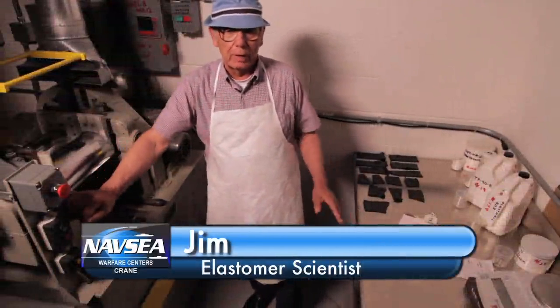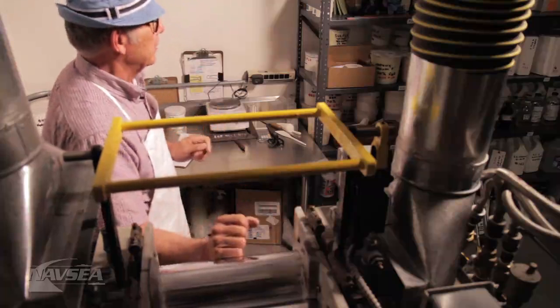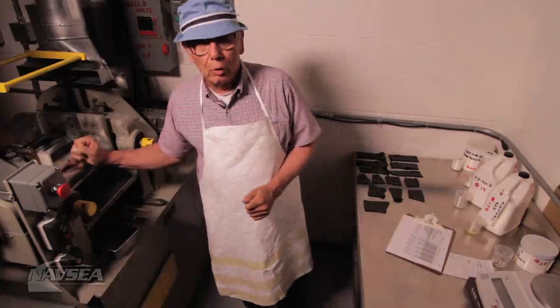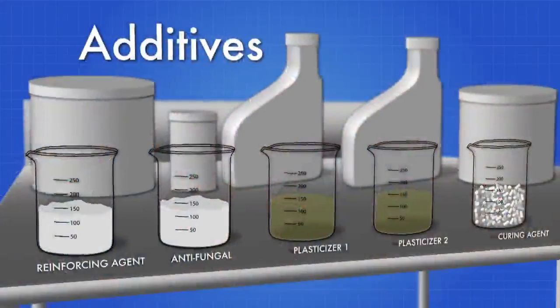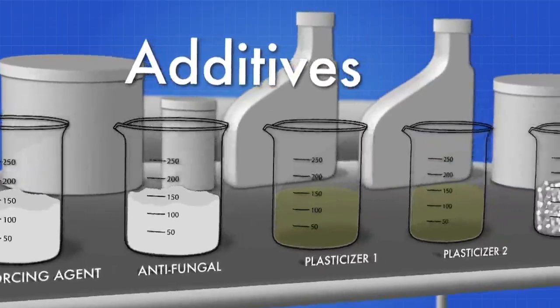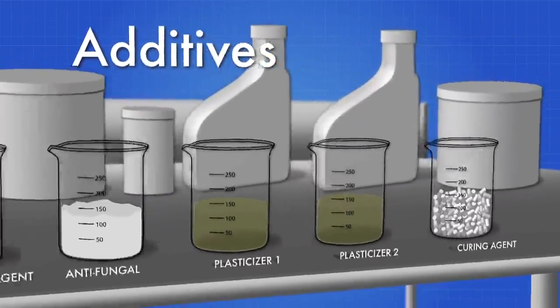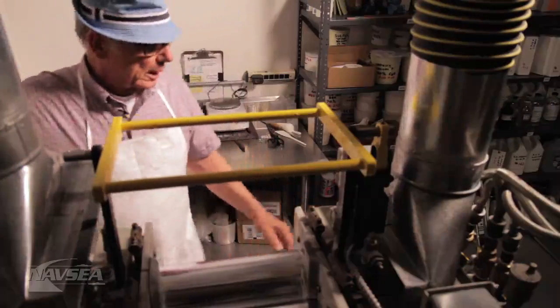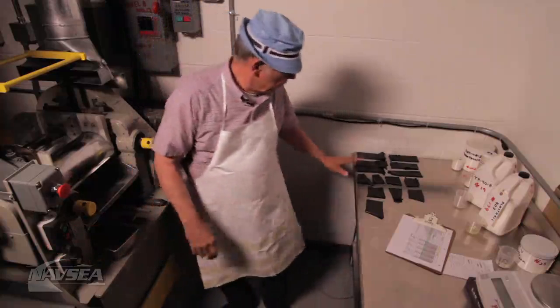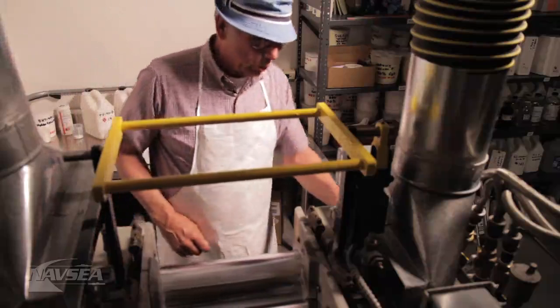Thanks Andy. We're back here at the laboratory mixing mill — the very first area of our processing. We are going to show the class a rubber mixing mill. This is a two-roll mixing mill. We are going to take this rubber and add all of these additives to these two different types of rubber. What we're actually doing here is finish mixing. Now I'm going to turn the mill on, put the rubber base on, and then add the chemicals.